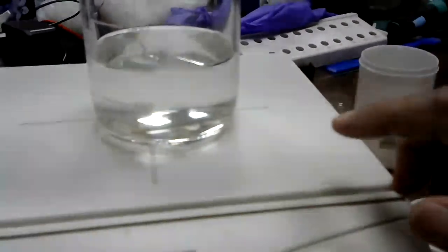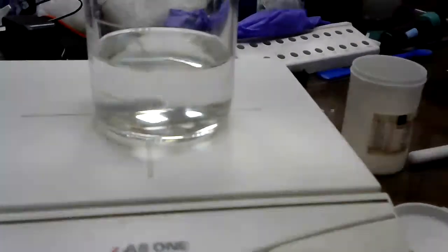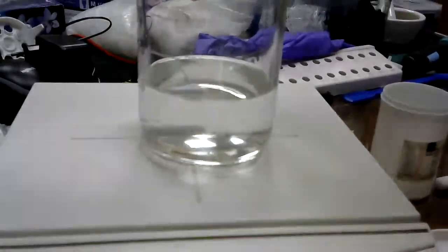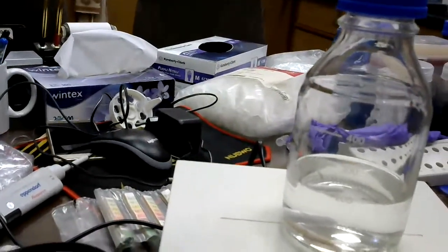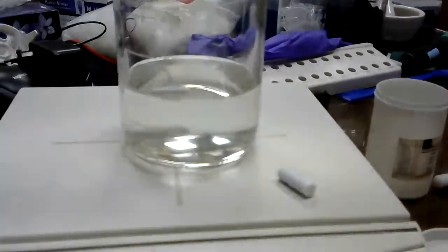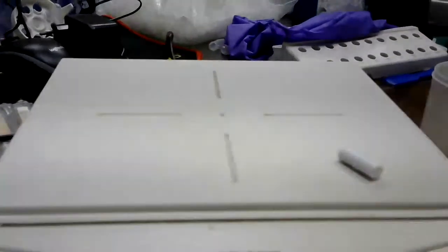So this is a magnetic stirrer. You can do it like that, and if you switch it off, it will stop. Okay, and now whatever bit is sitting inside, let me show you here.